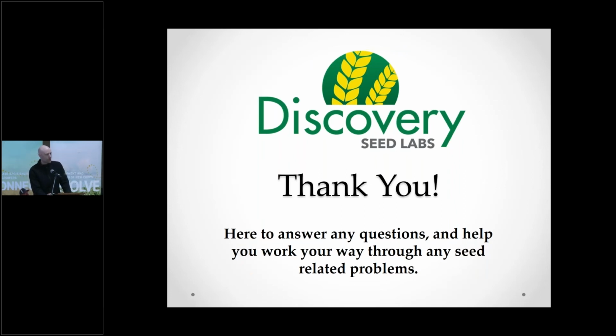But we can also do it in the spring. We realize that's a little bit late if you've already made some decisions. But if there is something that you're concerned about, or if you could switch between one field and another fairly easily as far as seeding, we can still do this test in the spring. And the tissue sampling can be done anytime that there's a crop present in the field.